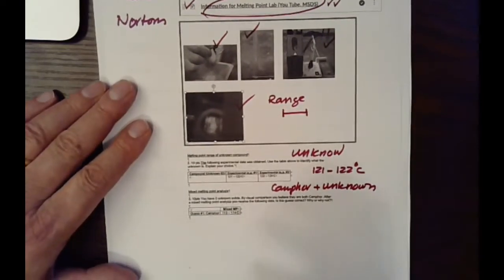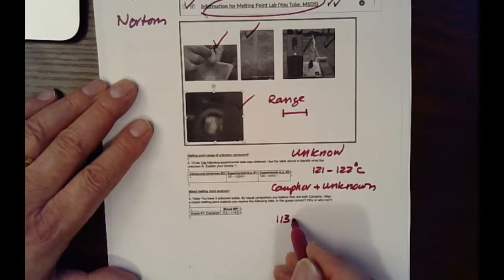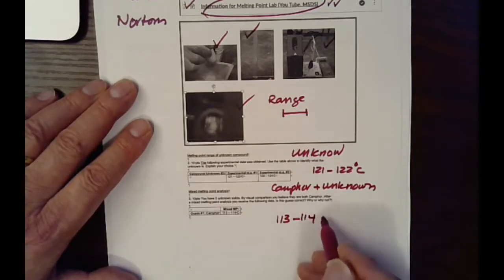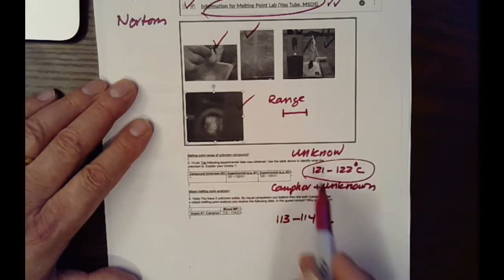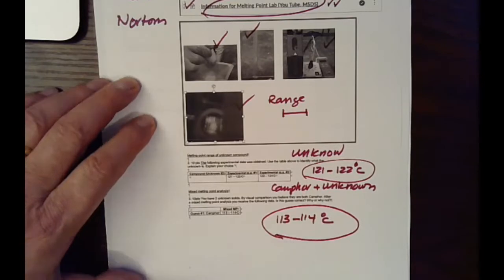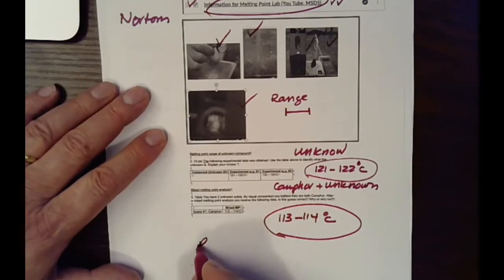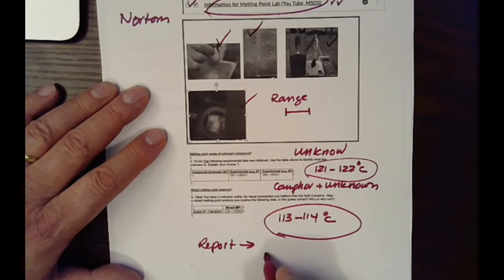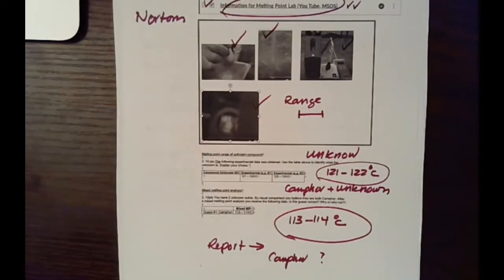Okay, and then you check the melting point again, and your melting point was 113, 114. So your original melting point was 121. After you mixed it with camphor, was 113, 114. And you reported, as part of your report, that your unknown is camphor. So is this good or not good? I don't know. I'm leaving it up to you.